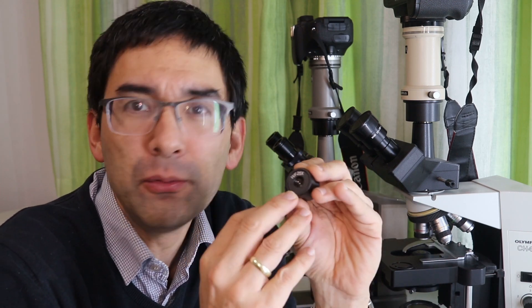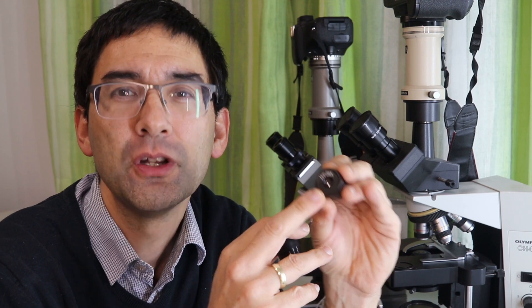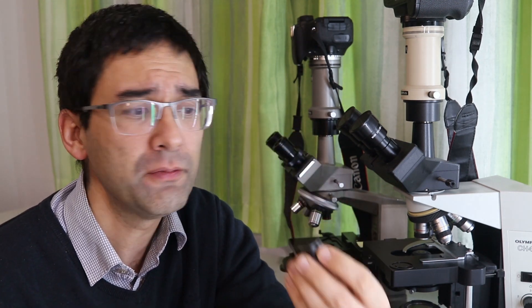So to my knowledge there are no eyepieces that have more than 25x magnification. But if there were, the disadvantages would be really large because then the lens would probably be even smaller and you have to move even closer. And you do not really gain a lot. So that is really I would say the maximum, 25x is really the maximum that you probably want to have.